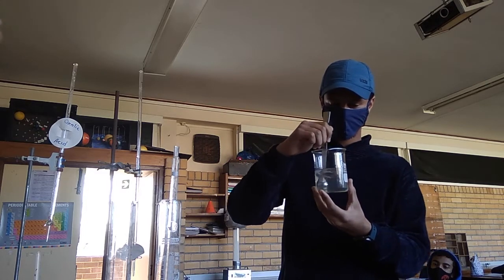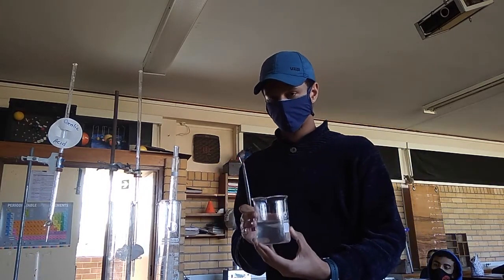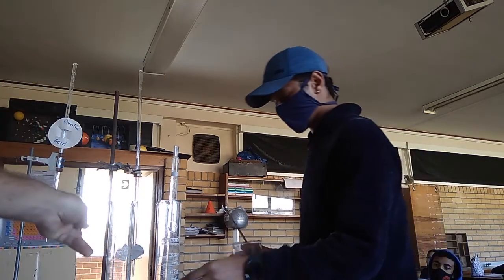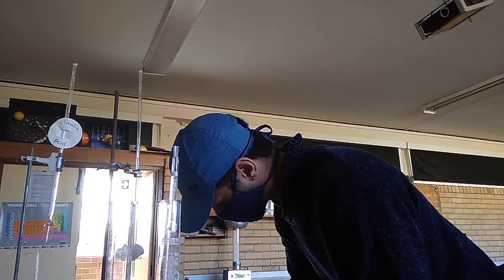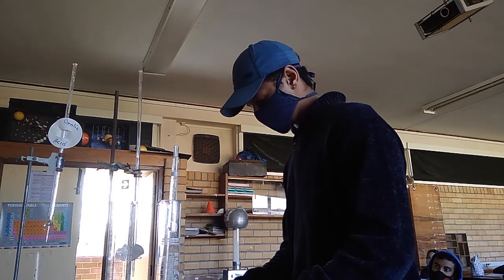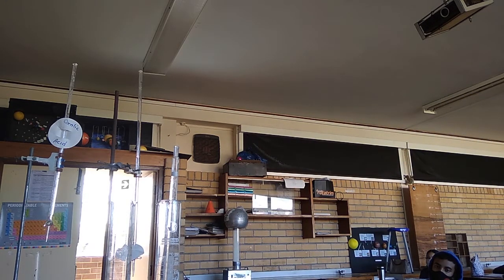There's our unknown solution. Now, Kyle, because we could easily forget it, won't you put it onto a filter paper that's got NaOH written on it? Here's a pen. Okay, and then you can just put that on, and if you don't mind, sanitize your hands again. Okay, so do you see how we get our one unknown? Was that difficult? No. Now we've got to get a known solution of oxalic acid.